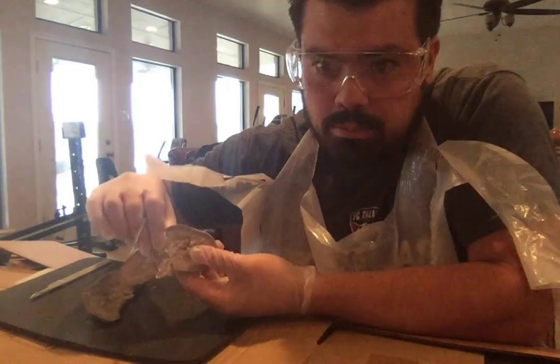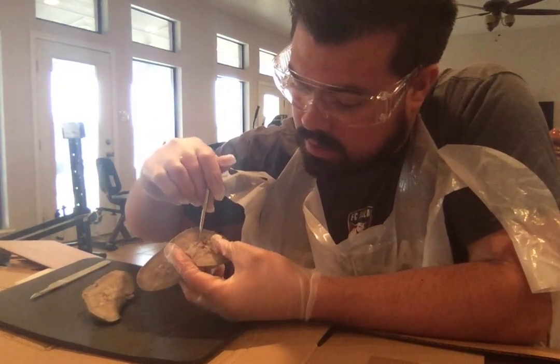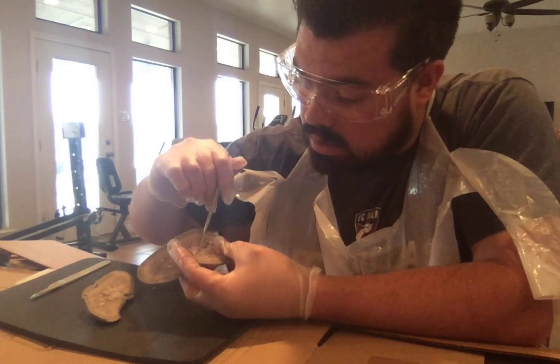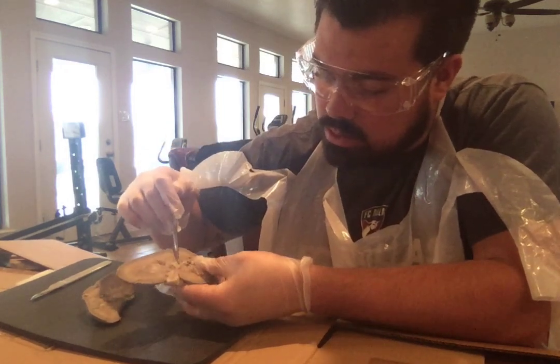as I pull it apart. You can find those holes, like there's one right there. And the renal sinus is lined with fat, which is that really white substance throughout there.